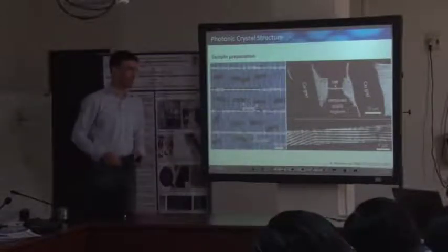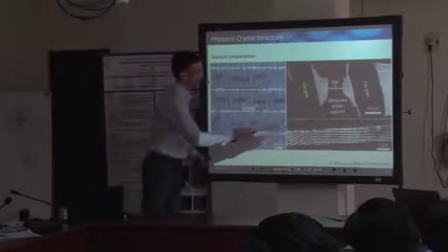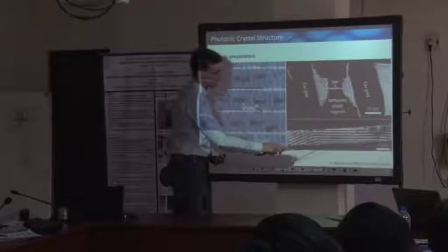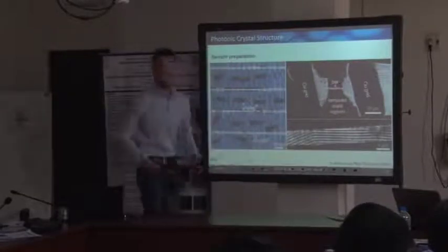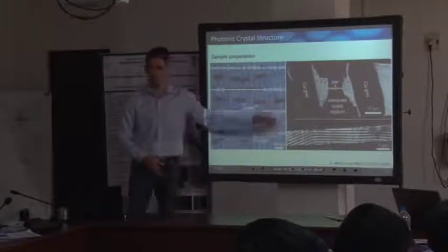This is what Christina just did in a blind way. So she removed almost all that material. And finally, we came up with such samples with a width of 1 micrometer or 1.5, and a thickness of like 2, 2.5 or 3 micrometers. And if you now tilt that, you don't end up with severe shadowing. Okay?